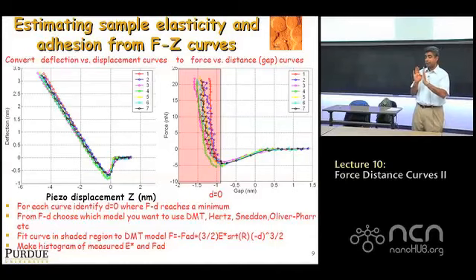So typically you take SEM images in two orthogonal planes, with high resolution, like FE-SEM, field emission SEM images, and try to fit the radius of a circle to those images that you see and use that radius here. That's probably the best way to do it.